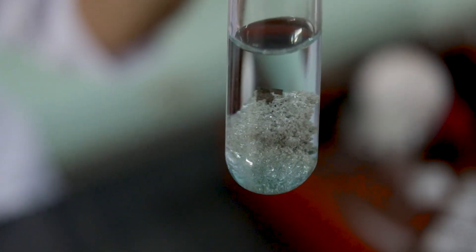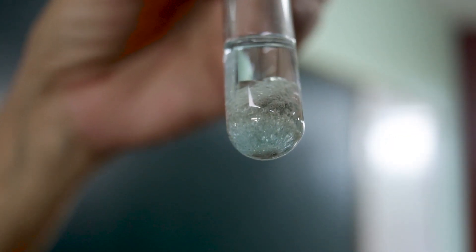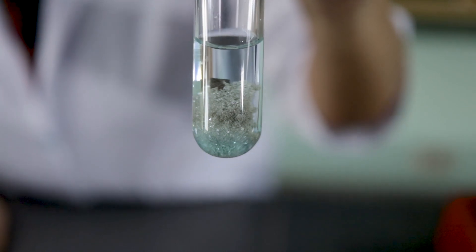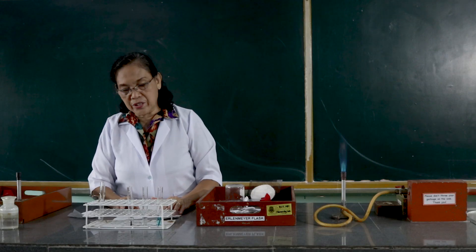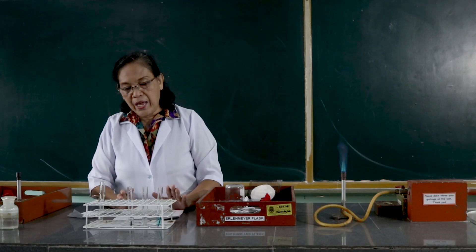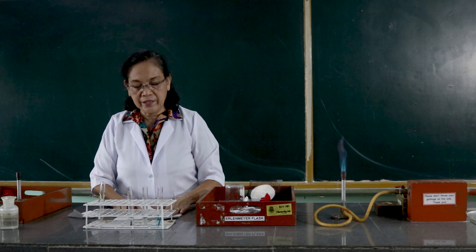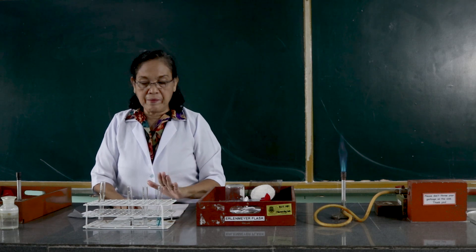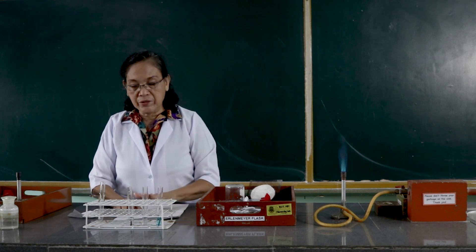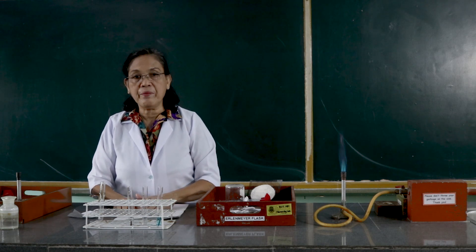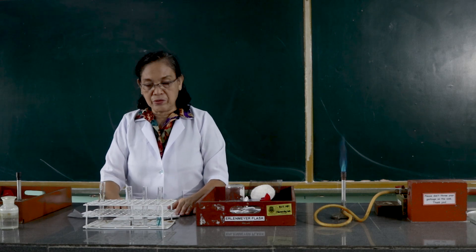Now we are going to observe what will happen to these solutions — what will happen to the iron, to the magnesium ribbon, and to the copper wire when they are placed into the solutions.